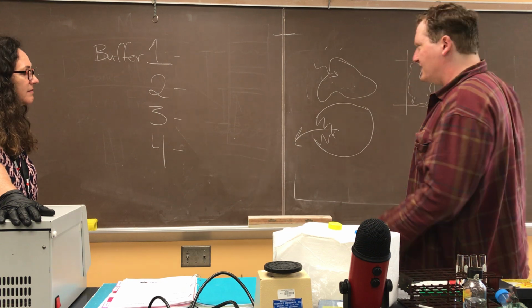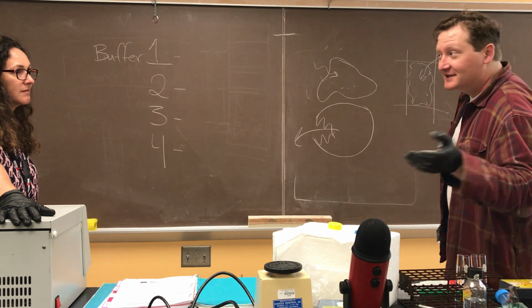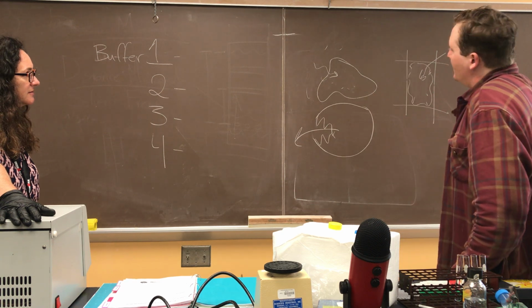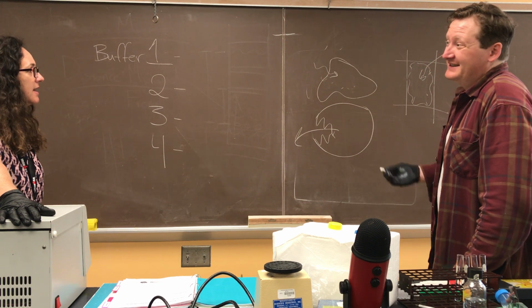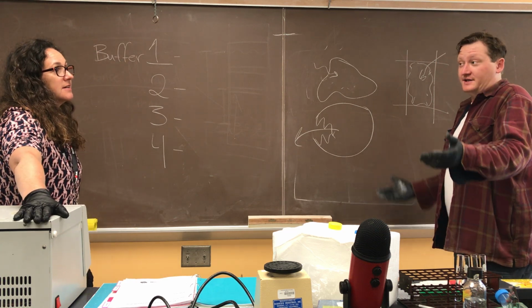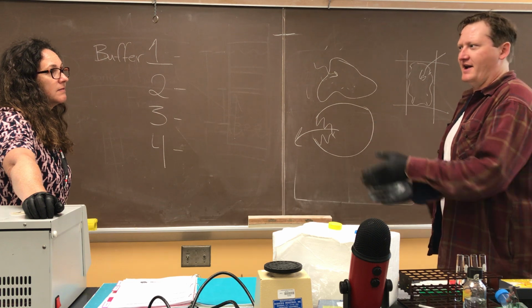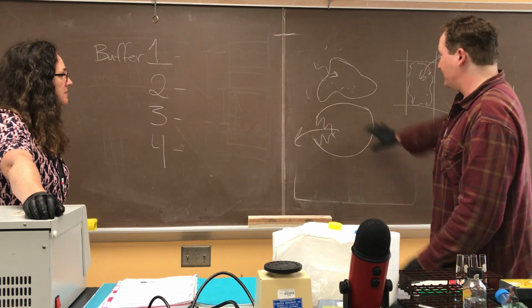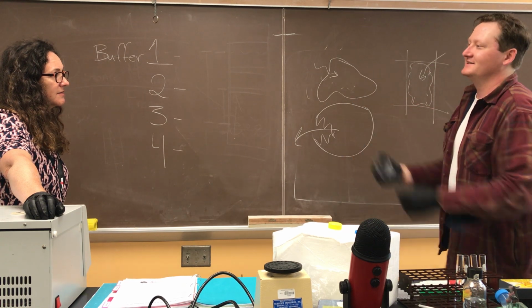Alright? I believe that runs through the background information that's necessary. Oh, in an isotonic solution, net movement's equal. Yeah, no big change there. So that covers that. We also do briefly need to discuss the importance of a detergent. So what would happen to a detergent in each of those cases? Well, the detergent is useful in breaking up those regions of hydrophobicity, right? It breaks up the molecules comprising the membrane, the phospholipid bilayer. So you get the same sort of process going, where the membrane dissolves away and cell contents are lost.